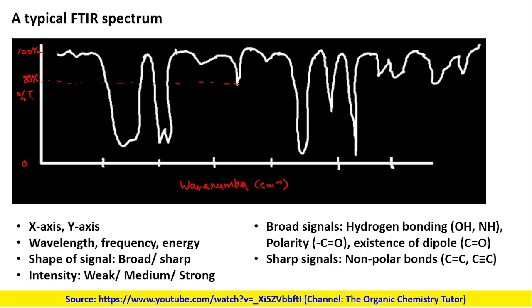This peak has its maximum dent at 80%, which means 80% of the IR light has been transmitted.